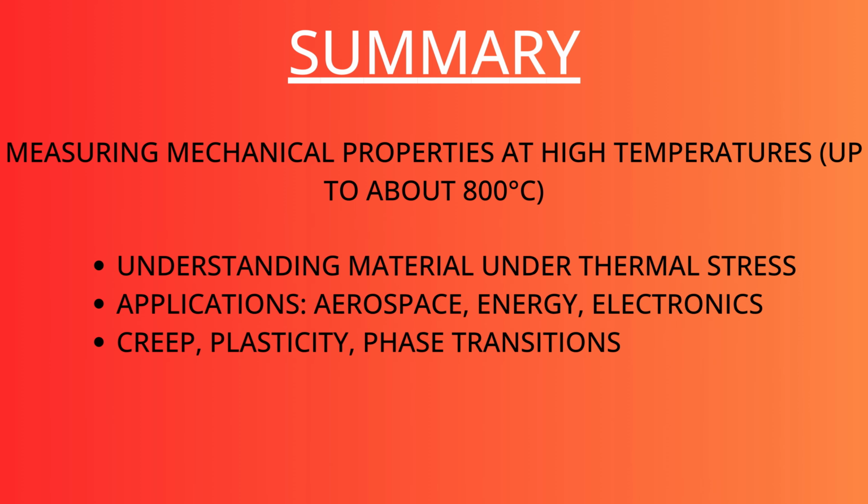Well, why do we use it? We want to understand material behavior under thermal stress. It's crucial for applications in aerospace, automotive, energy, and even electronics. And it also reveals creep, plasticity, and phase transitions.